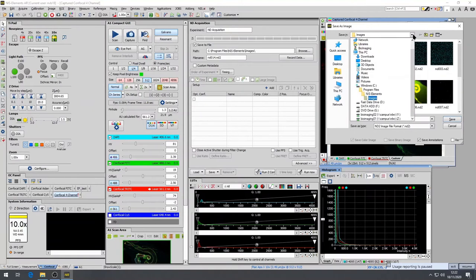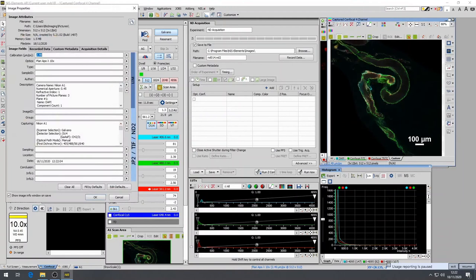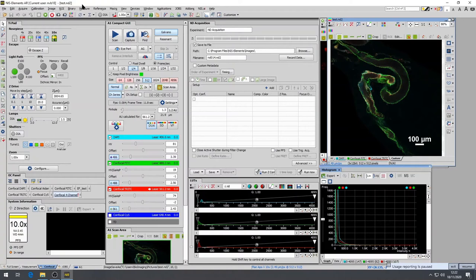Single-dimensional 2D images can be saved as TIFF files. But note, it is not recommended to save files in JPEG format. As above, go to file, save as and you should be able to select TIFF as a file format to save.